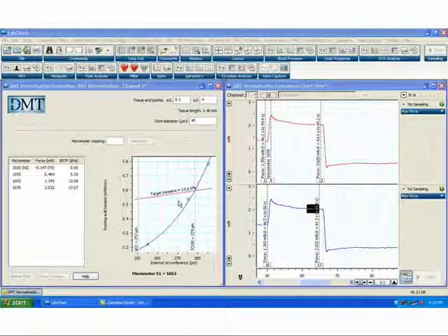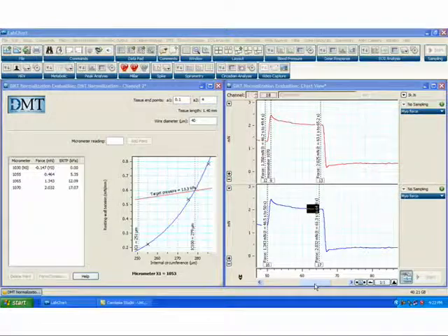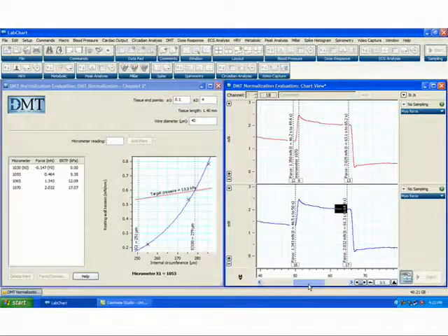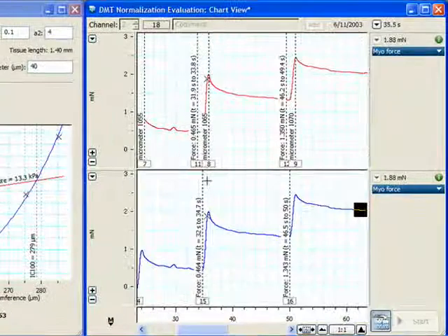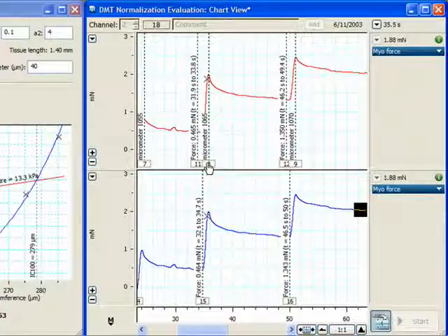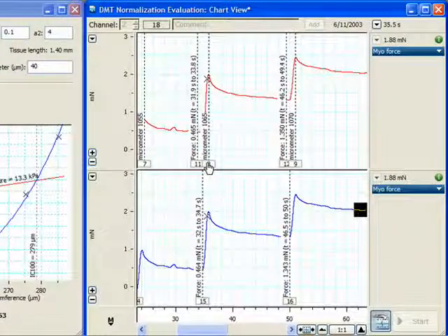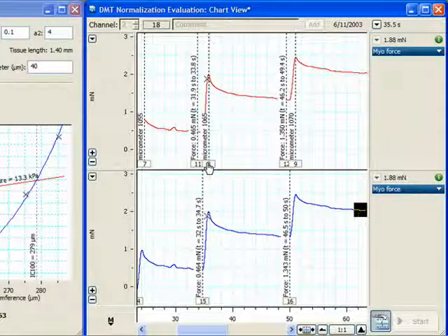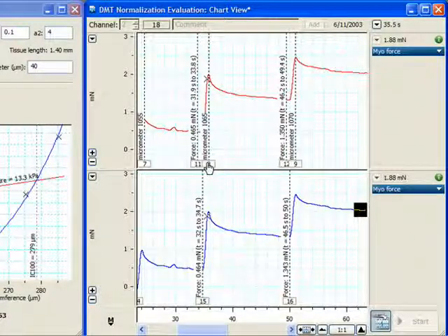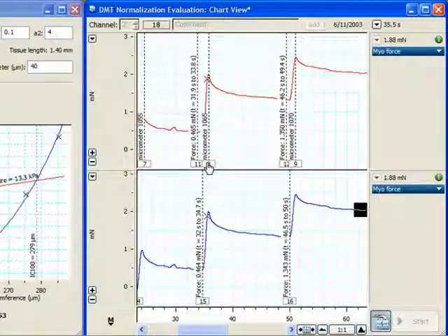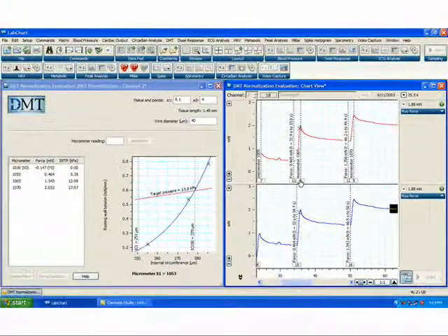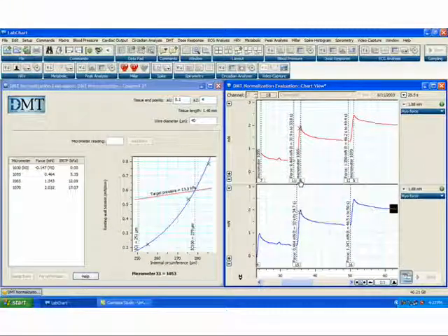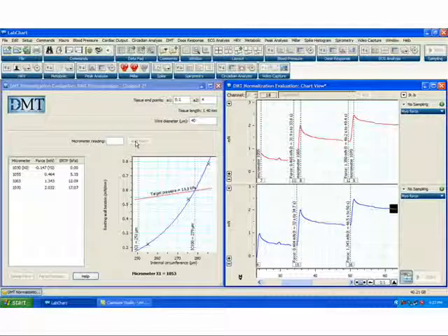Please note that in this file, the micrometer readings were entered as comments into the chart data for post-acquisition analysis using the DMT normalization module. However, to save time in acquisition and analysis, you can use the DMT normalization module in real time as you record. In this case, you would set the micrometer reading, enter it here, and click Add Point.